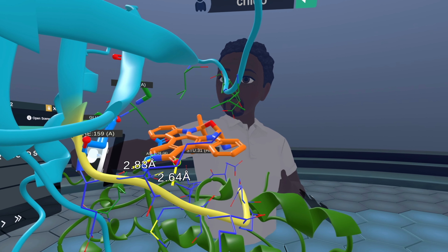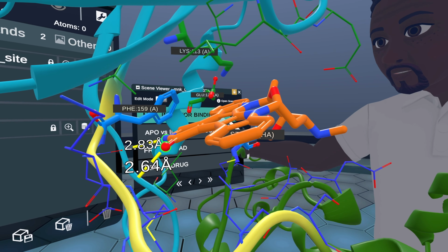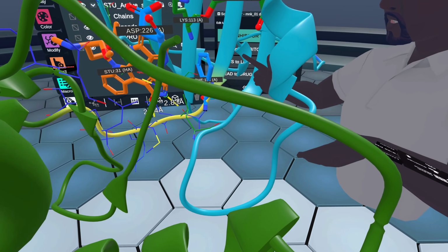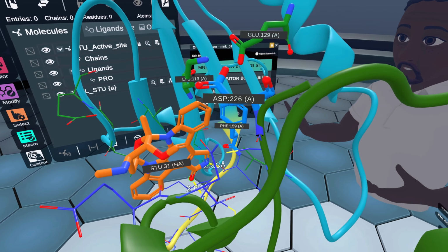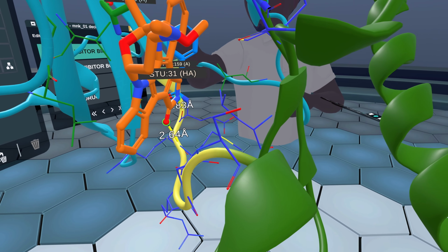And at the top, there's this residue here. This phenylalanine at the back, should we rotate it around so that people can see it on the other side? We certainly can rotate it around. So what I'm going to do is rotate it around so people can see. I'm standing behind it. The reason why it's highlighted here is because in kinase terminology, this is called the gatekeeper.